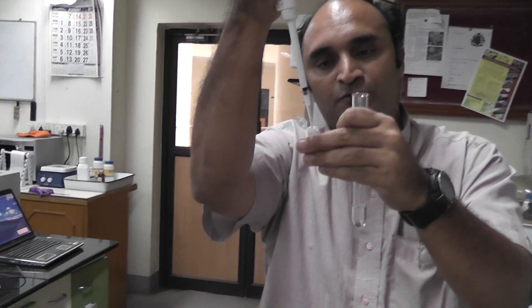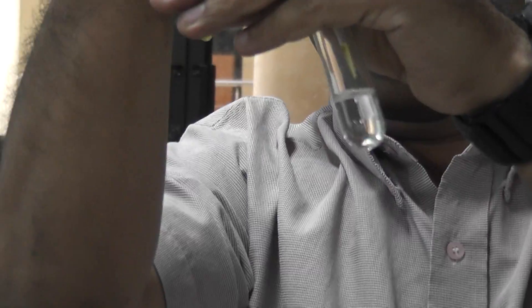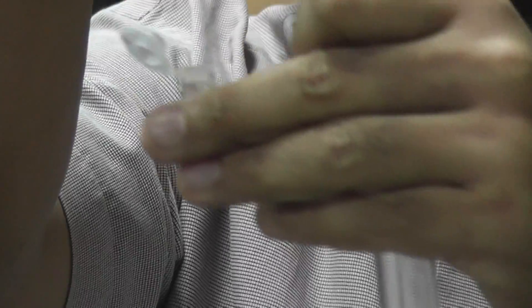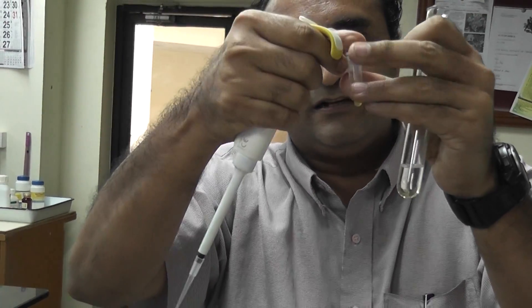First, using this micropipette, we add 25 microliters of gold salt solution into this solution. As you can see, we have transferred 25 microliters of gold salt solution into this test tube.